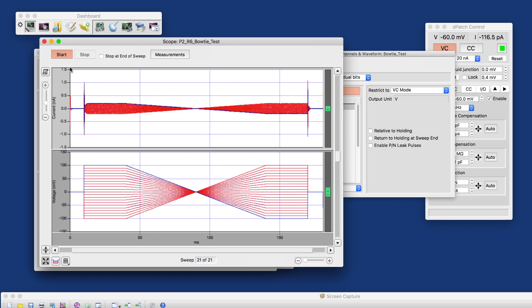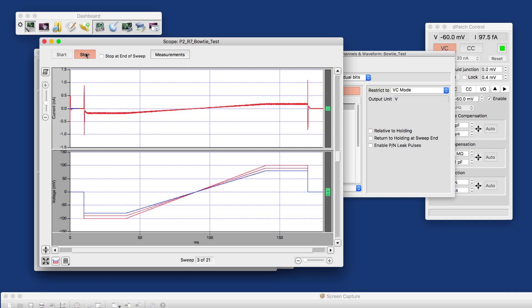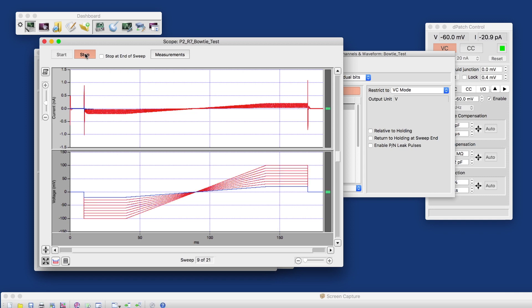And this executes here. Let me start that a second time, and I don't even need to let that finish. I'll just stop that.